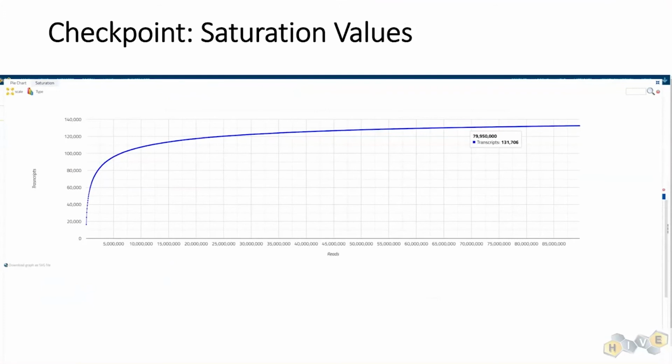So there may be some cases where you would expect to see a ridiculously high number of transcripts, but if this is something like a cell culture experiment, particularly a monoculture, where you expect to see one cell type represented, then you should not see numbers this high in most cases. And so this is, again, just something to be aware of.